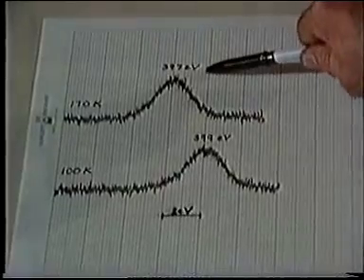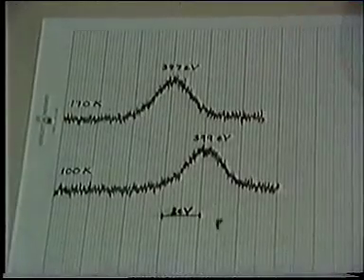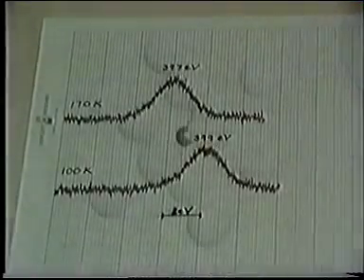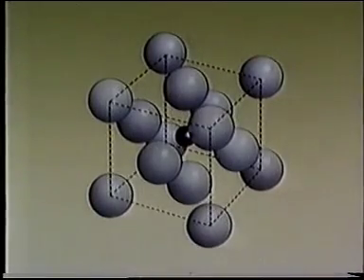To test this idea, Professor Ertl looked at the compound Fe4N, iron nitride. He found that its nitrogen 1s spectrum contained this same peak at 397 electron volts. Now, the structure of Fe4N is known. Here's the unit cell. It contains a single nitrogen atom, monatomic nitrogen. So here's evidence that the signal at 397 electron volts is due to monatomic nitrogen bound to iron.